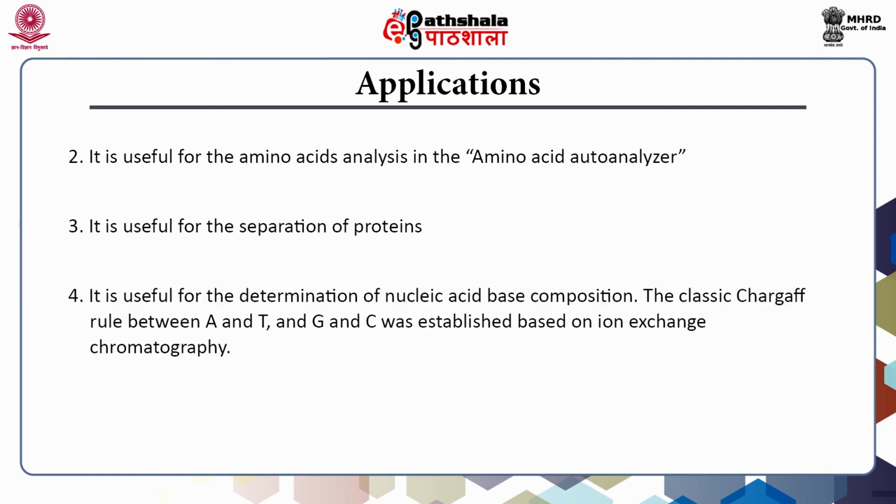And one more important application of ion exchange chromatography is the determination of nucleic acid base composition. It is a very well known fact that the Chargaff rule, which tells that A binds with T and G binds with C, was mainly established based on ion exchange chromatography.